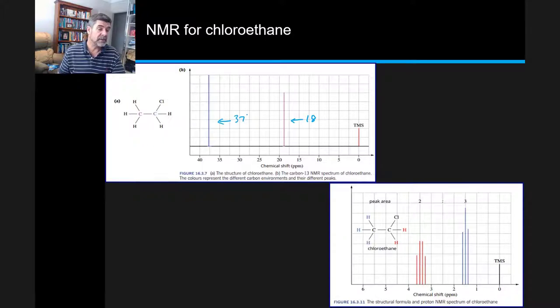We would need to look at these to get an idea of what we're actually looking at. One of these is corresponding to a carbon environment which contains carbon-hydrogen bonds, and one is telling us that there is a bond to a halogen present in the molecule.